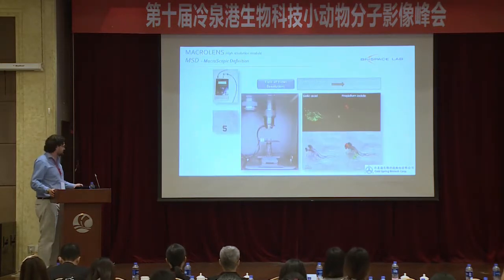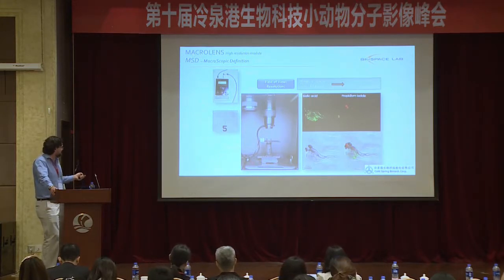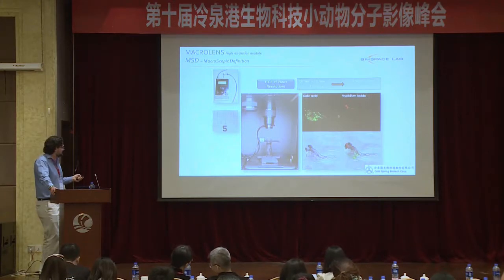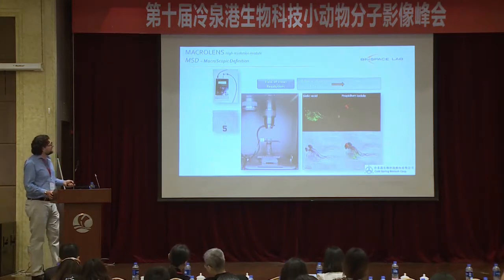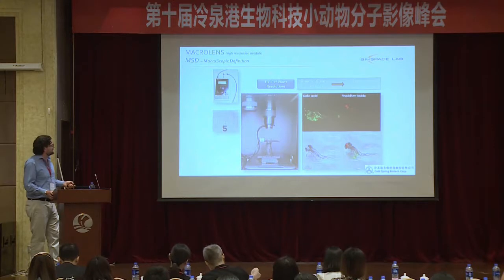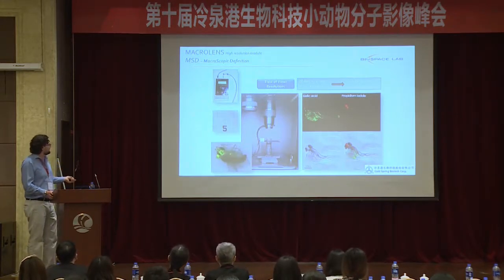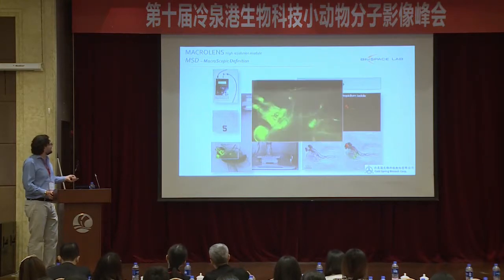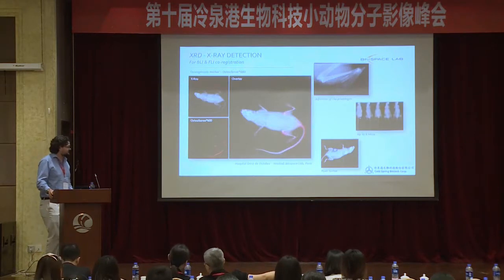And we have a macrolens module. The macrolens module is a macrolens with X, Y, Z axis, piezoelectric guided for high precision, and you have a joystick on the outside of the machine to control the focus and the positioning of the samples. And here's an example of zebrafish imaged with the macrolens, looking at two fluorescence markers, sialic acid and propidium iodide. And another example here of a live Drosophila with a GFP-labeled neuronal marker. And you can see the high resolution of the axons of the nerve endings going down the paws of the Drosophila here.